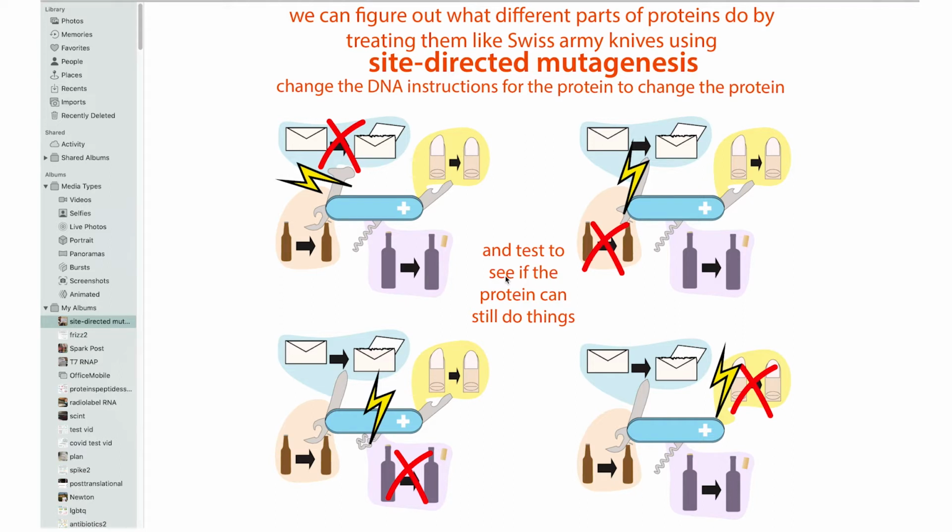Even if we don't have structural information on that specific protein, we can look for conserved regions in the sequence that we know have some function in a different protein. In all these cases, we want to test if the theory is right. Does that thing really do what it looks like it should, or what we think it might do? So we want to make changes to the protein to see if it really does the thing we think, and maybe we'll find something unexpected.